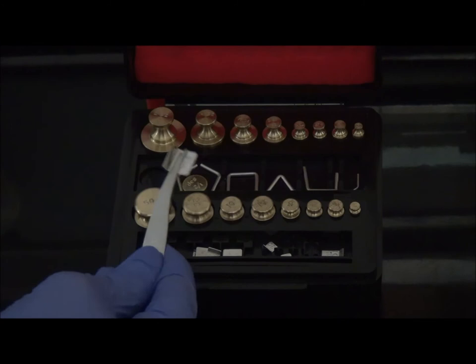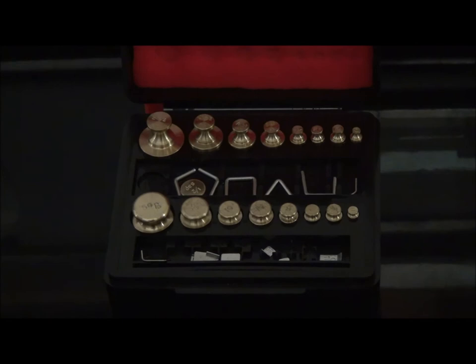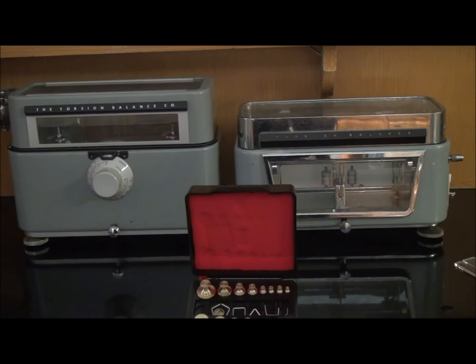The smaller square-shaped milligram weights are made of platinum or aluminum foil with one edge folded up, allowing for easier handling with forceps. Smaller weights are more easily lost and, with continual handling, may corrode and give inaccurate measurements as a result. It is more convenient to use the graduated beam — which comes as a calibrated dial or a rider — to measure smaller quantities or fractions of a milligram.